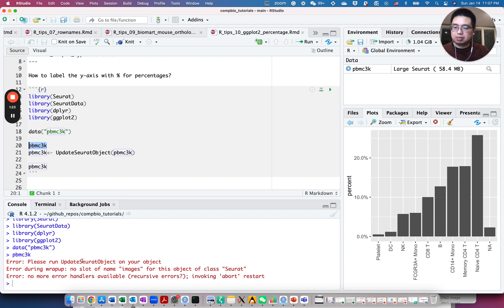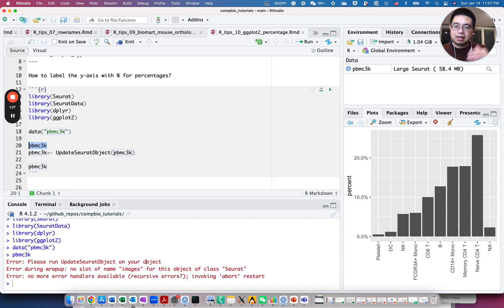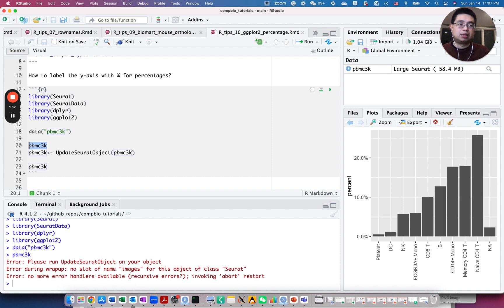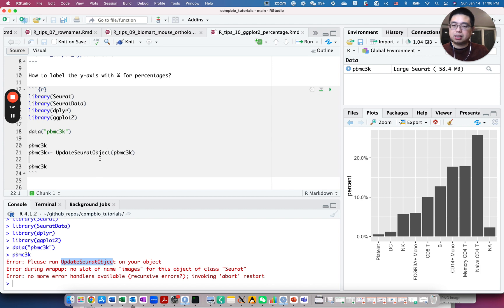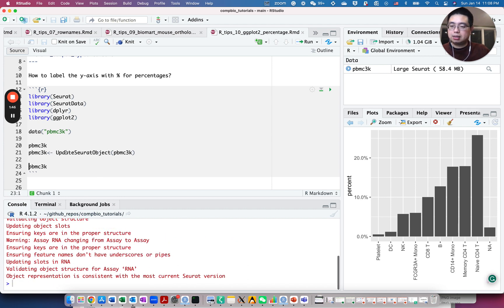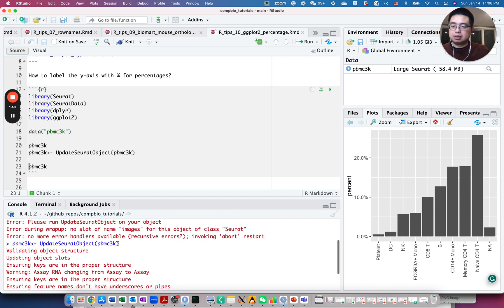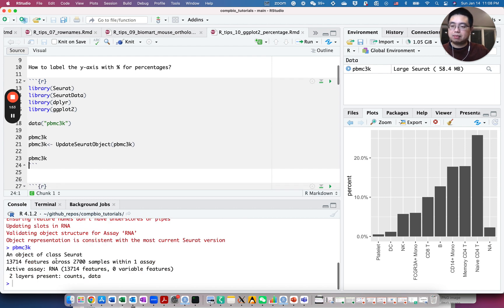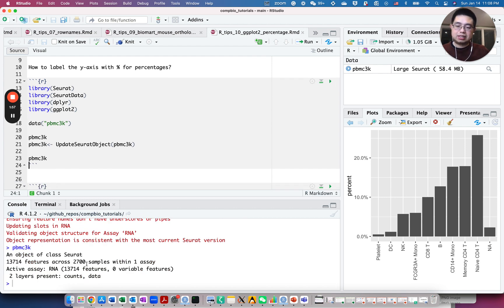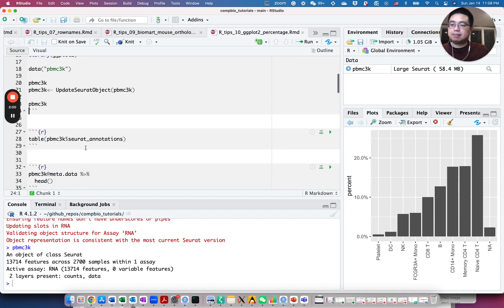So it's very likely in the later Seurat version, it actually requires this slot called images, but the old object, the Seurat object, didn't have those. So we can just read the error message and update the Seurat object and assign it back to the variable. And then we'll actually add all those missing slots. And now if you run this again, there's no error message. There's just 3000 cells PBMC data.